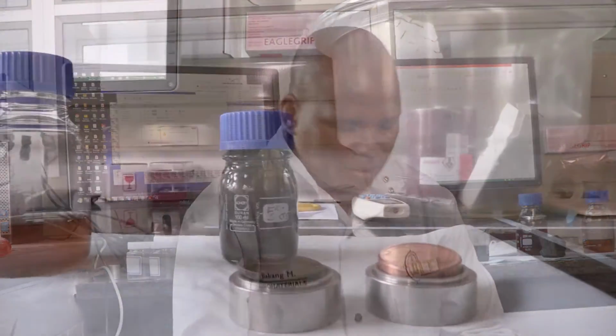We have an XRF, a WDX type of machine, which we call a wavelength dispersive X-ray fluorescence spectrometer. And then we have an XRD, which is an X-ray diffractometer, which characterizes the mineral composition in the materials.